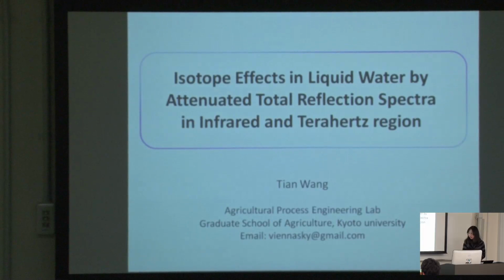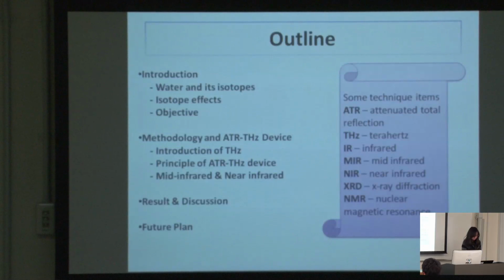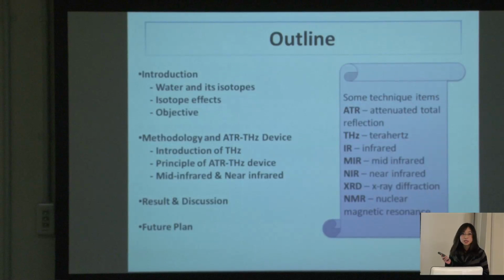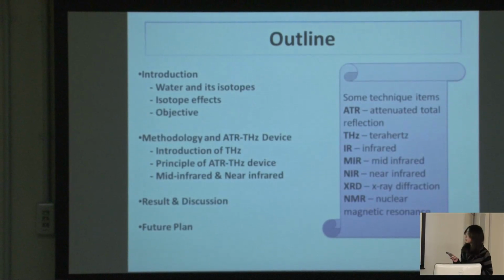in infrared and terahertz region. This is my presentation outline. Here are some technical items I will use in my presentation. In the introduction, I will talk about water and its isotopes, as well as isotope effects. In methodology, I will introduce terahertz and also the ATR terahertz device. Also, I will introduce the mid-infrared and near-infrared devices I used in my experiment.